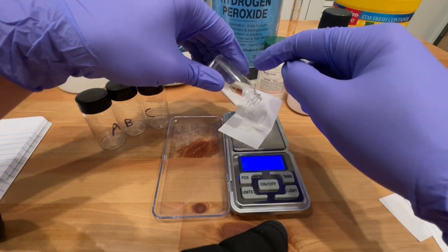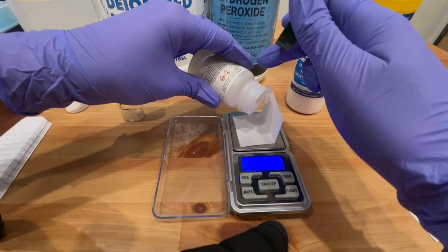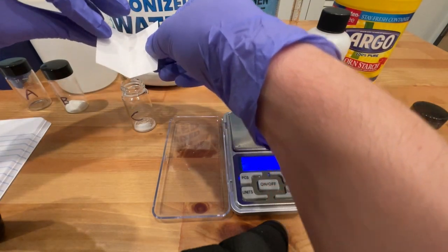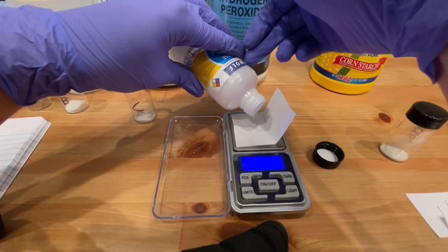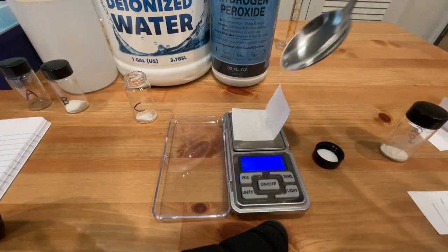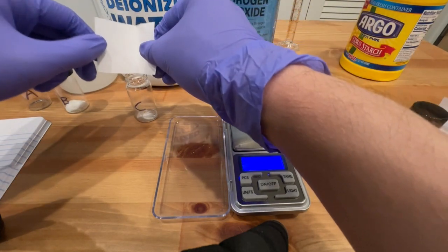First, 0.65 grams of potassium iodate was added to vial B. Then 0.24 grams of malonic acid was added to vial C. 0.05 grams of manganese(II) sulfate was added to vial C. Finally, 0.01 grams of cornstarch was added to vial C.